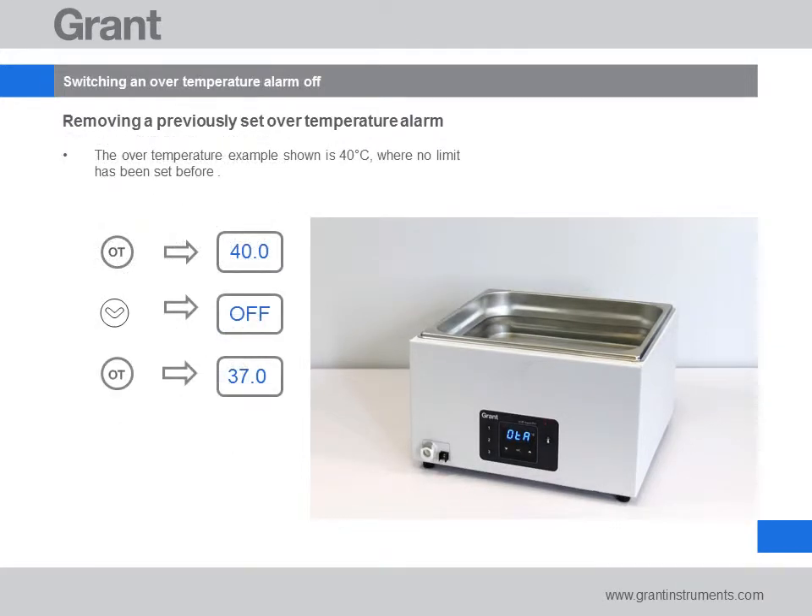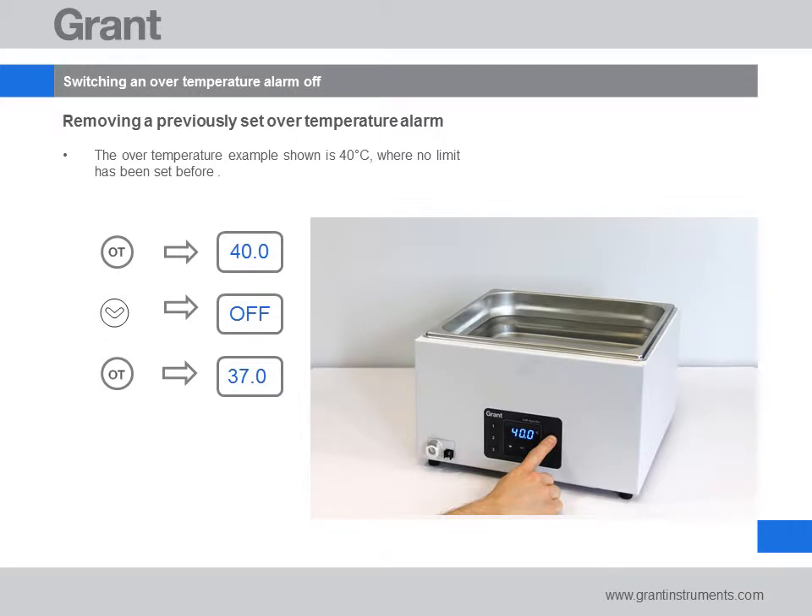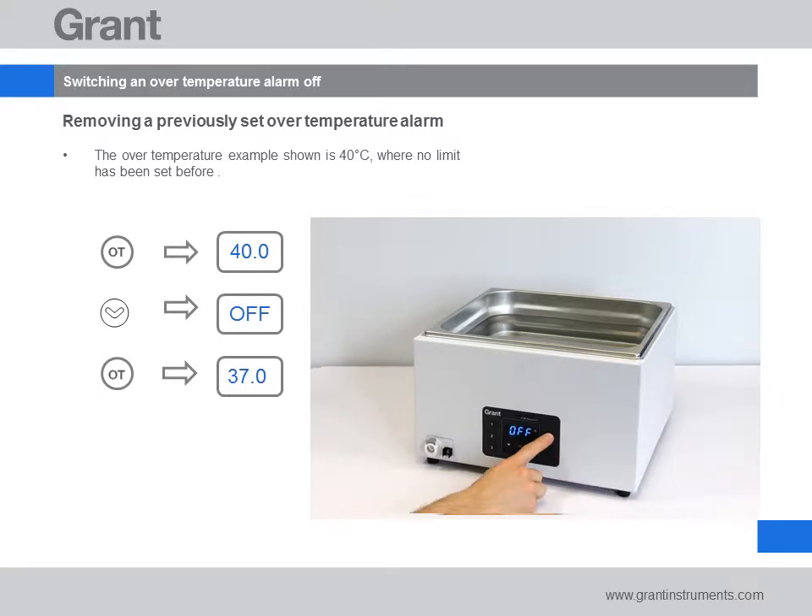If you no longer require the over temperature alarm, this is how you disable this feature. Press the over temperature alarm key. The display will show the current over temperature alarm value — 40 degrees C in this case. Use the down arrow keys to change the temperature down to 10 degrees C. Press the down arrow once more and the bath will display 'off'. Press the over temperature alarm key to switch it off. The bath will immediately return to displaying the water temperature.